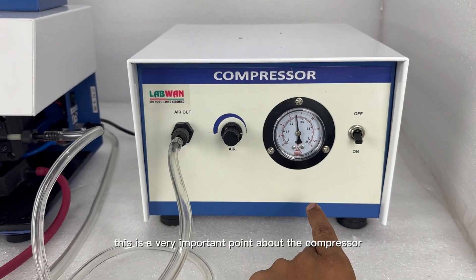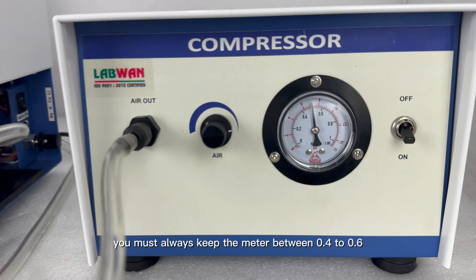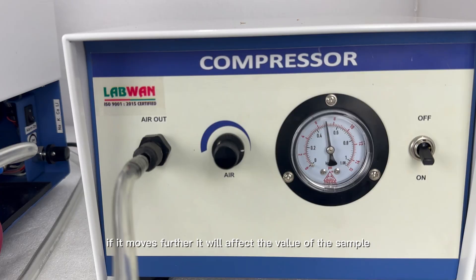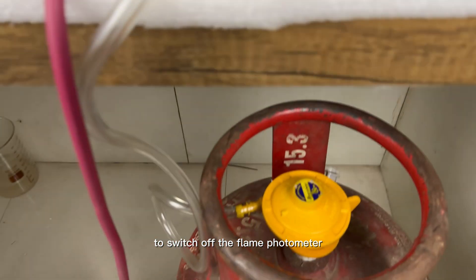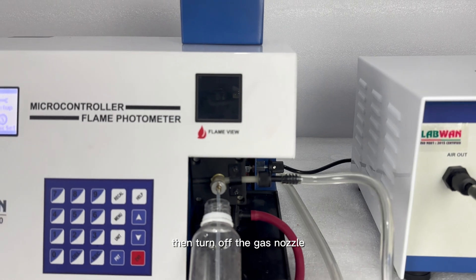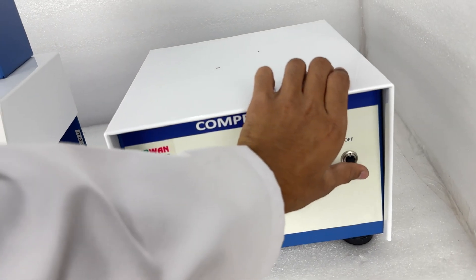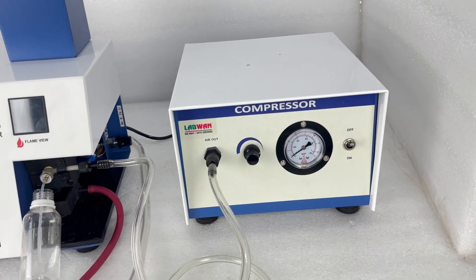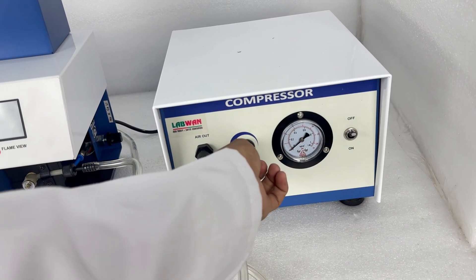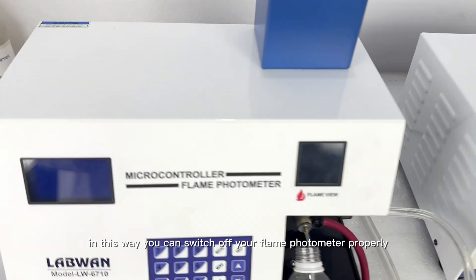This is a very important point about the compressor — whenever you use a flame photometer, you must always keep the meter between 0.4 to 0.6, kept at 0.5. If it moves further, it will affect the value of the sample. To switch off the flame photometer: first, turn off the gas and wait for the flame to go out, then turn off the gas nozzle. Then turn off the compressor, and after that turn off the main device. In this way you can switch off your flame photometer properly.